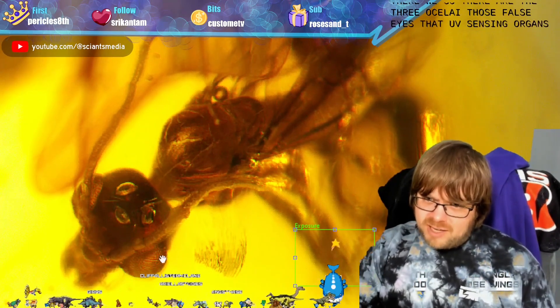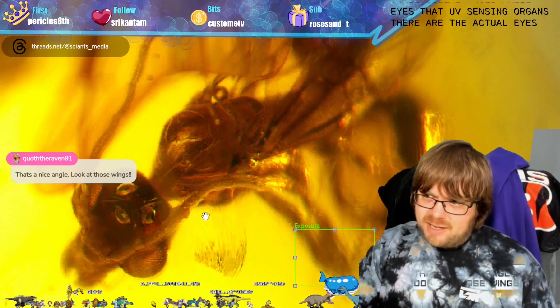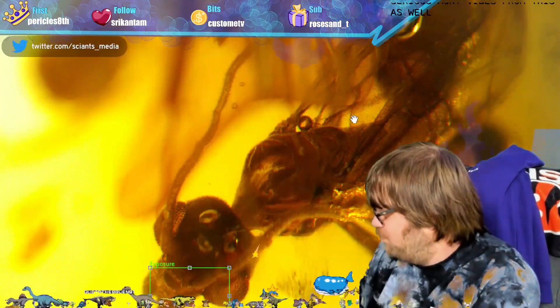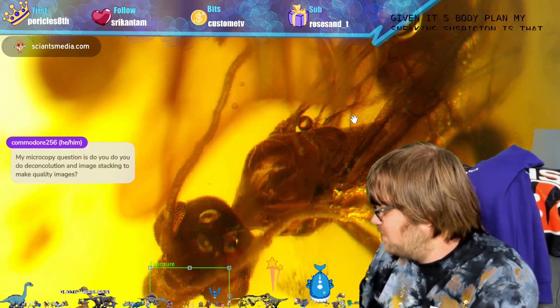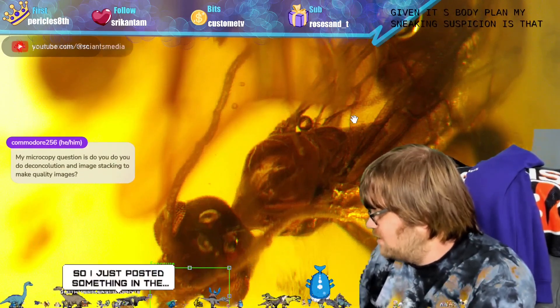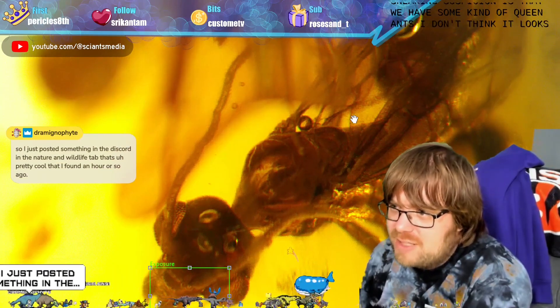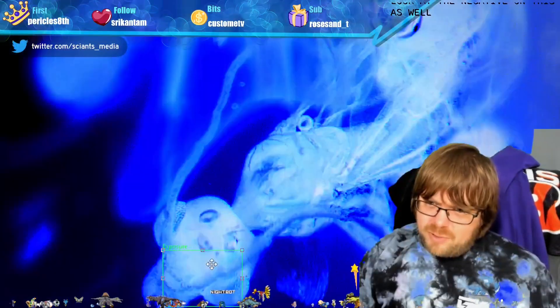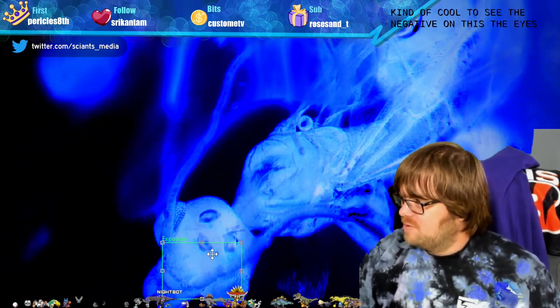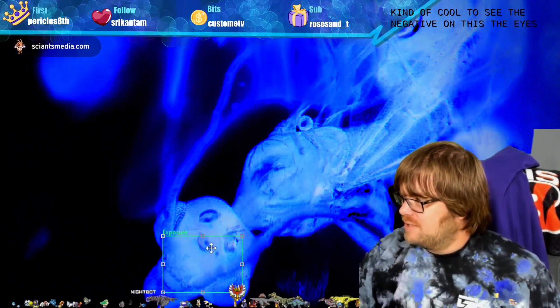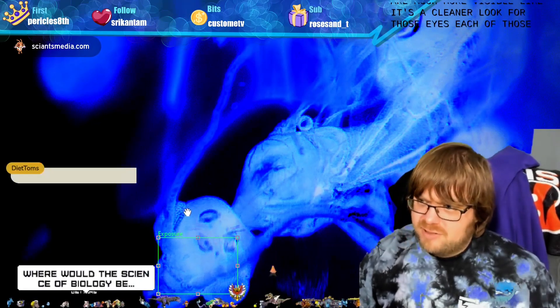There are the actual eyes with the ommatidia, and there are the mandibles again. Given its body plan, my sneaking suspicion is that we have some kind of queen ant - I don't think it looks very much like a male. The negative image is a cleaner look for those eyes; each of those cells is much more clearly identifiable.